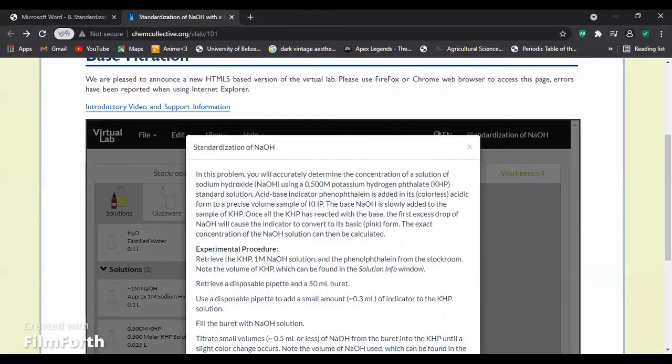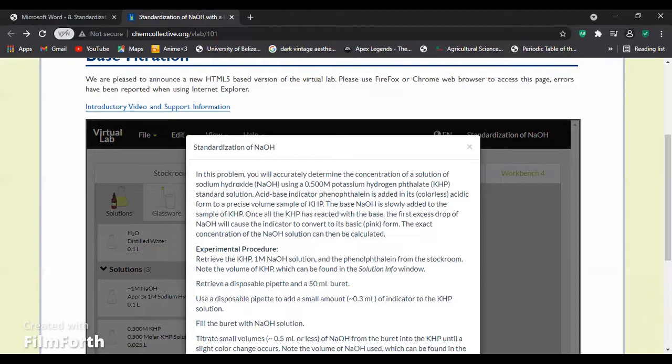In this problem, you will accurately determine the concentration of a solution of sodium hydroxide (NaOH) using a 0.5 molar potassium hydrogen phthalate (KHP) standard solution. We can now proceed.